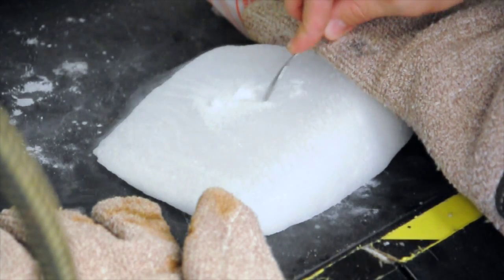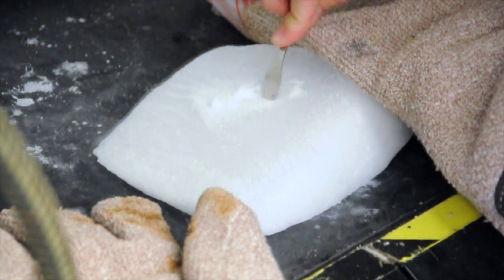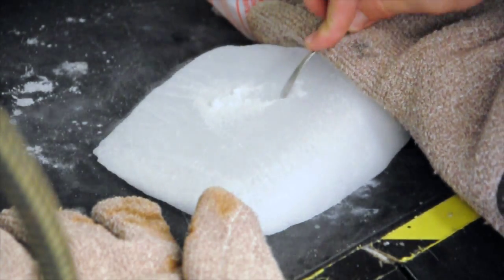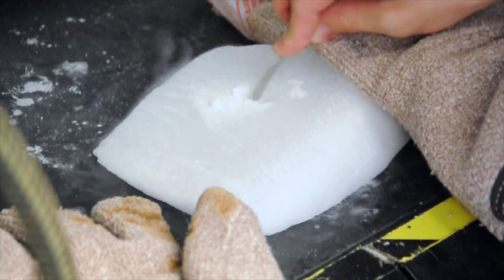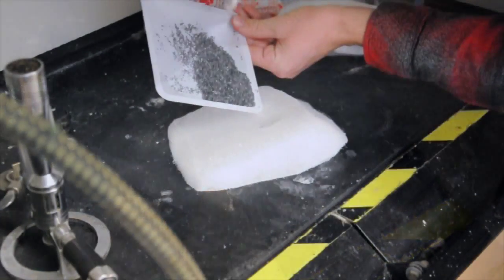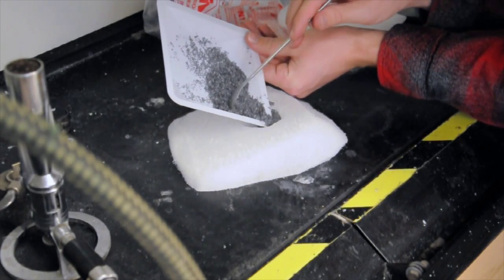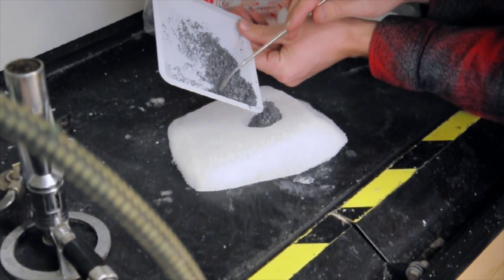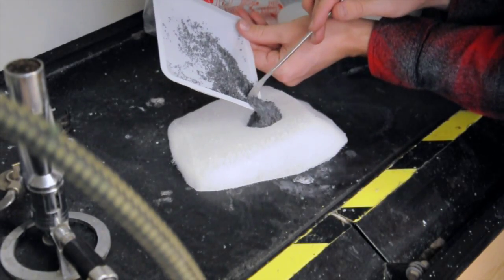The first step is to carve a small hole into the bottom block of the dry ice with the chisel, large enough to hold all of the magnesium scrapings. Once you have finished carving the hole, pour the magnesium scrapings into the hole and make sure that there is no magnesium on the surface of the dry ice.